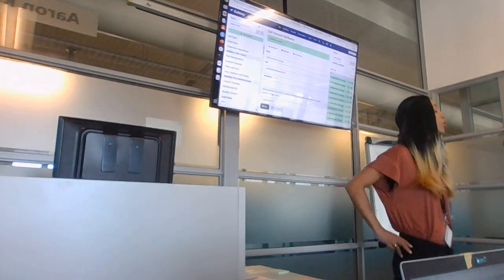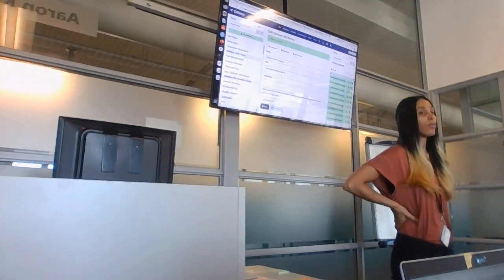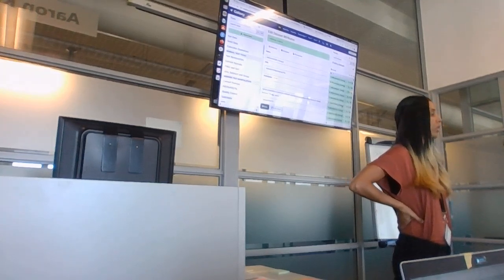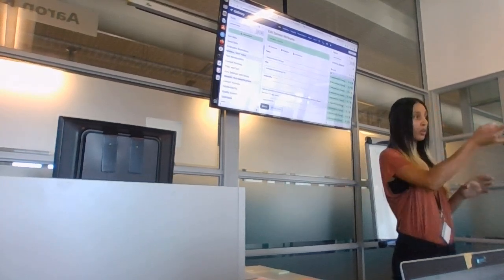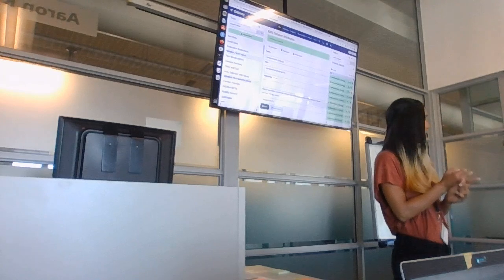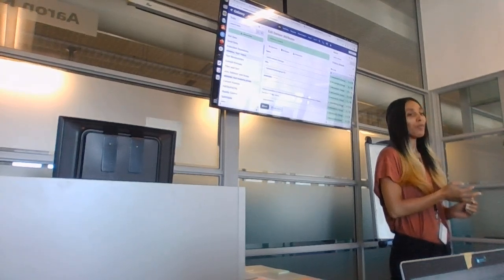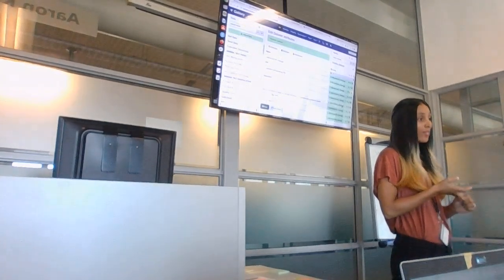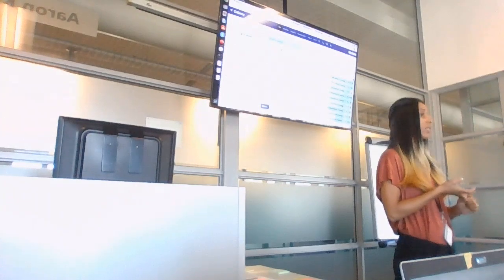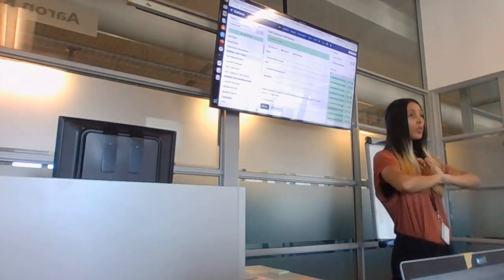So let's say you have Illumina paired data. What would you check about the data, about the files? You said you and Dafa check the file sizes. What else? Extension. Like I tell you, are they paired? That's what I was looking for.